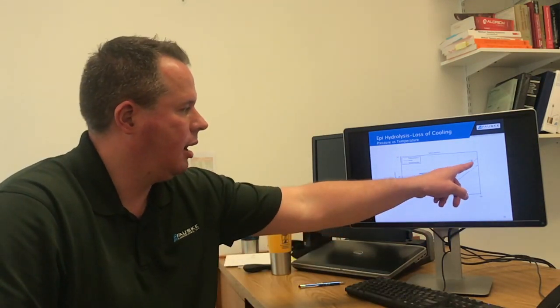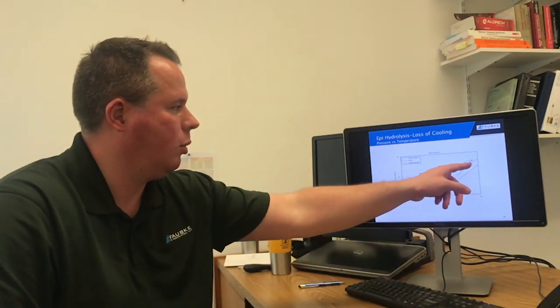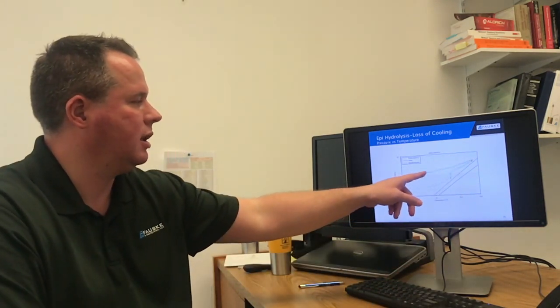proceeding. And then here at the end, it looks like maybe at these higher temperatures, there may be a different reaction going on where some non-condensable gas is generated, kind of giving a sign that we could be at the early steps of some type of decomposition or secondary reaction with the product. But the heaters were turned off here and the system was allowed to cool.